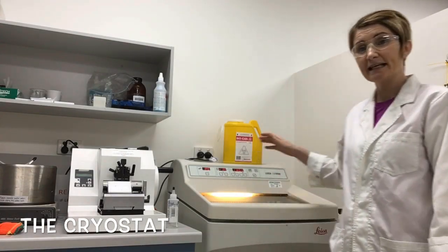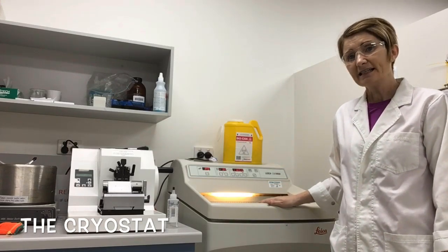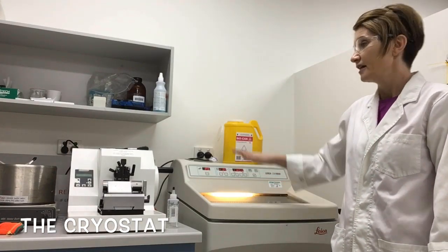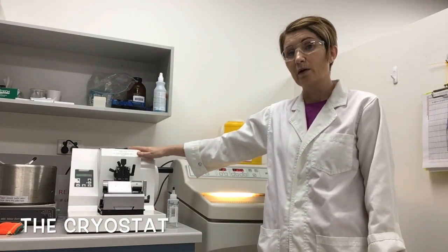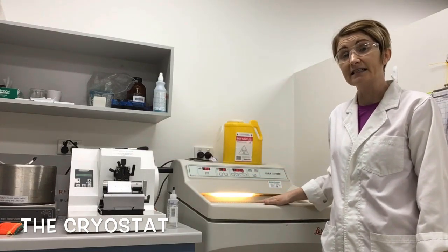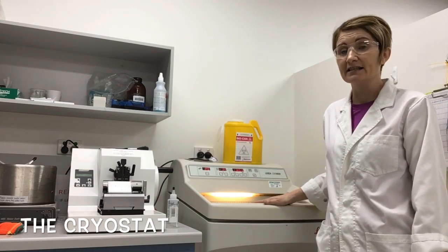Hi, I'm from the Histology Laboratory and today I'm standing next to a piece of equipment called a cryostat. A cryostat is basically a microtome that's encapsulated in this cover here, very similar to the microtome that we use on the lab bench when we cut paraffin embedded tissue. But the microtome inside this capsule is kept at freezing temperatures so that we can cut fresh, frozen samples.